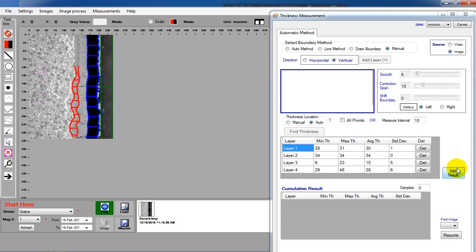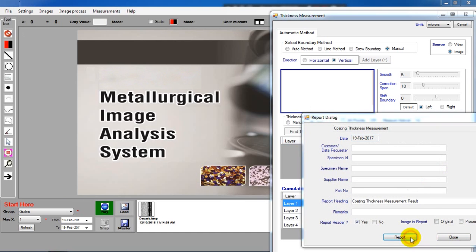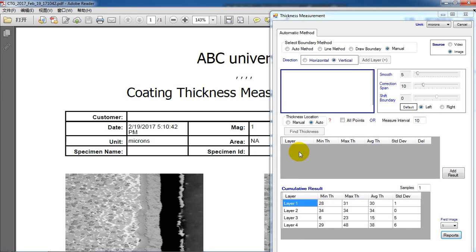When you finish, add the results and generate report.